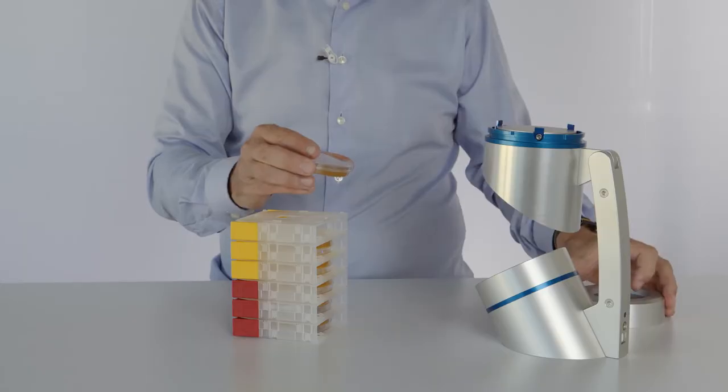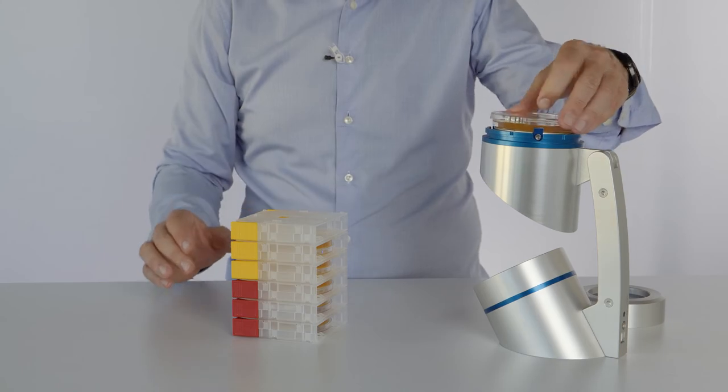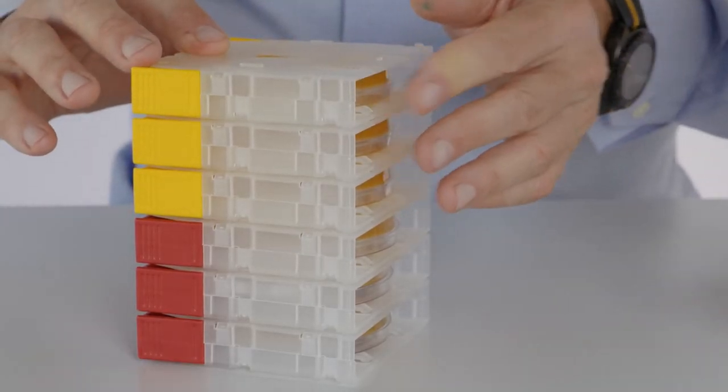When you need an air sample, you remove a plate, take the sample and place the Petri dish back in the dispenser.